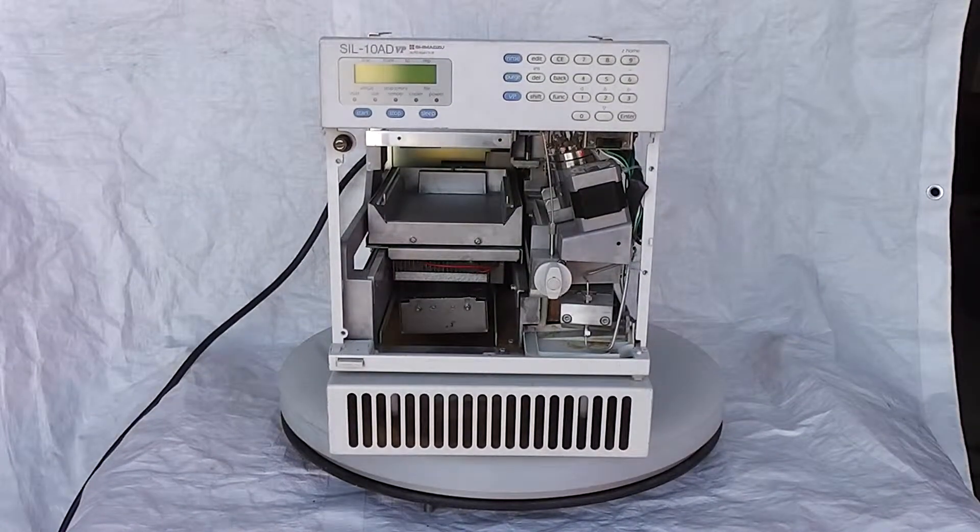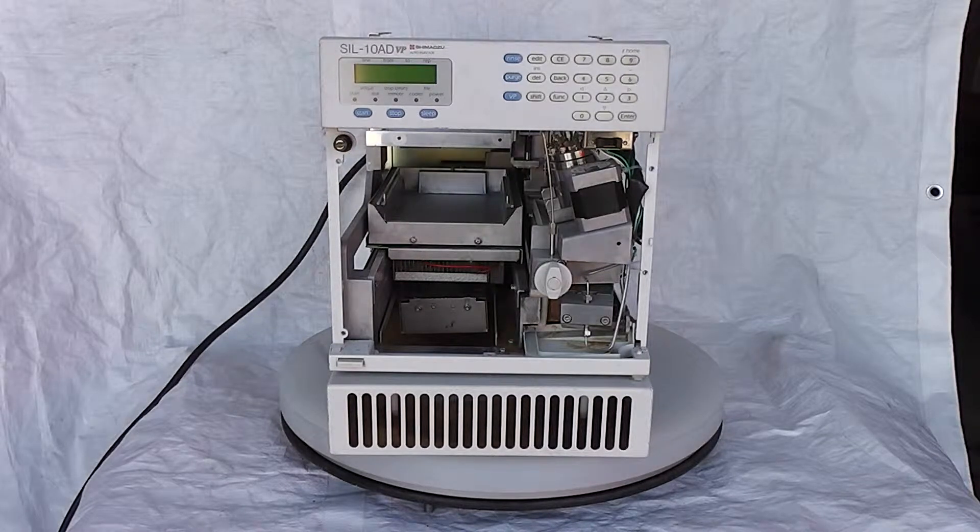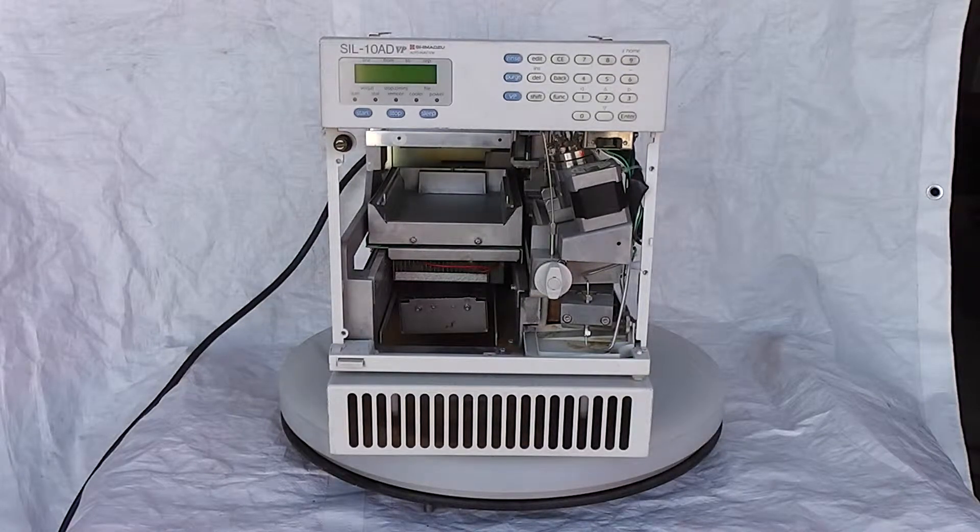This is a Shimadzu auto injector pump, model SIL-10ADVP. Shimadzu, made in Japan.